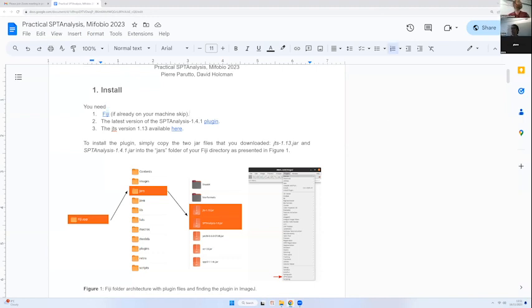So does everybody have the subject and everything? Yeah, you have everything, right? We can start. I think the SPT has been installed, so everybody has the SPTanalysis.